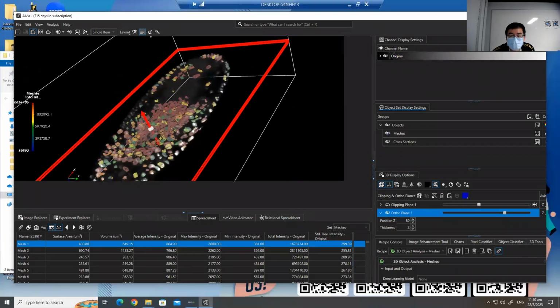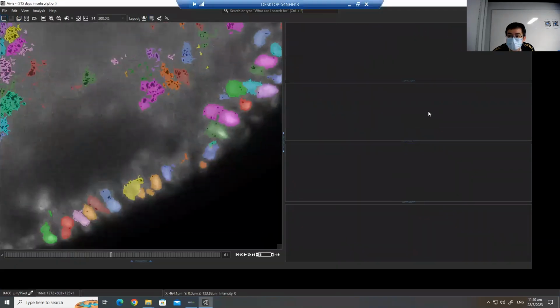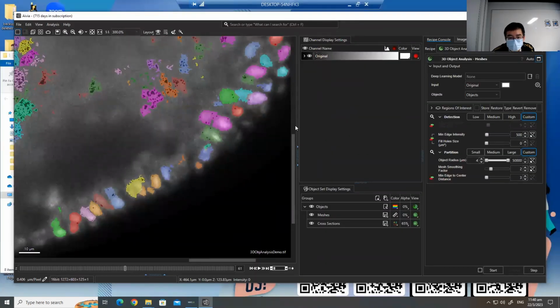Well, let's change the layout back to here. This better.